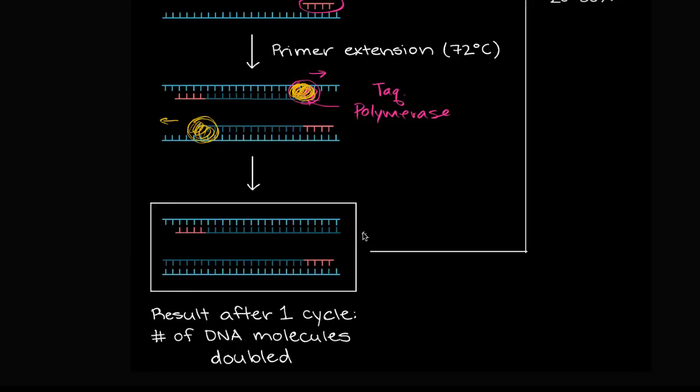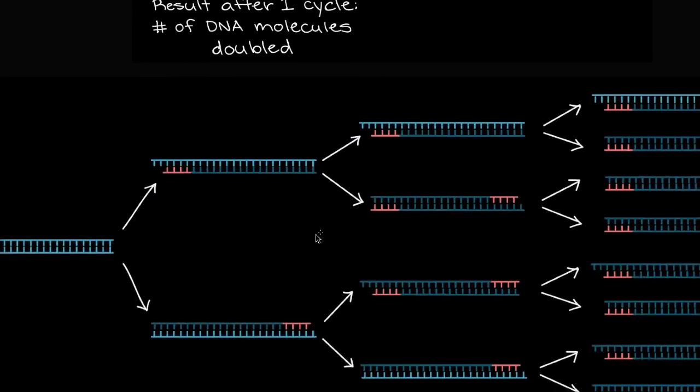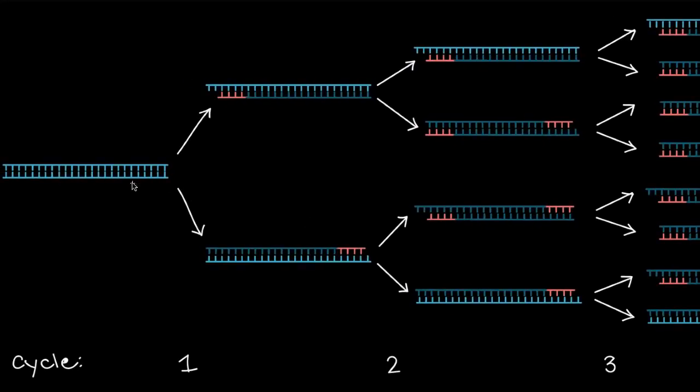So I guess you can interpret chain reaction in two ways, and one is what the polymerase does, it adds things to make a chain. But there's actually even more of a chain reaction dimension here, and that's that we're getting this exponential process going on. So you do one cycle, you get to this situation right here. You heat it up, the strands separate, you cool it down, the primers attach, you heat it up again, the Taq polymerase does its job. And like all polymerases, it goes from the 5' to the 3' direction. We talked about that in replication. So now you have two strands.